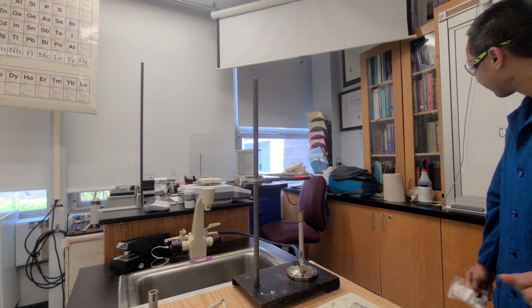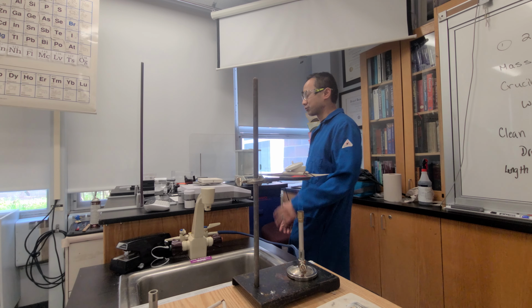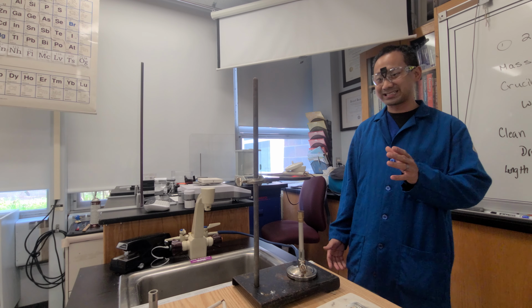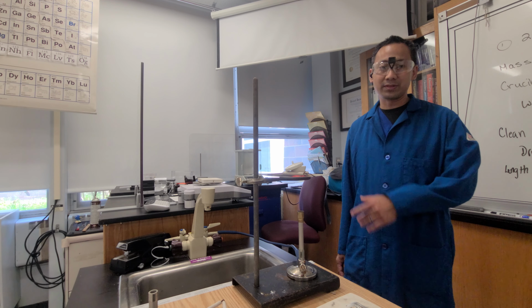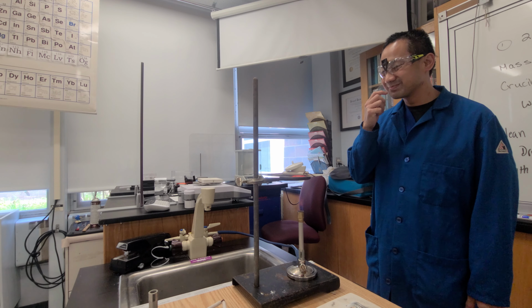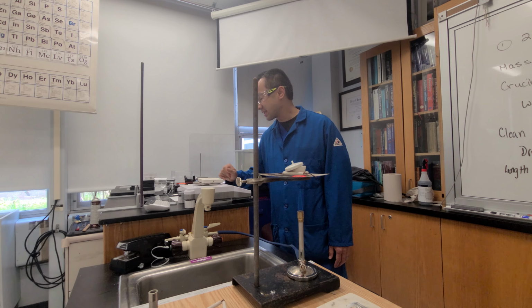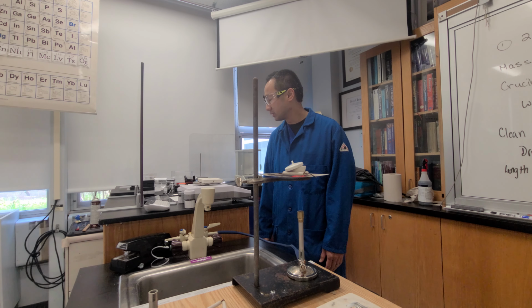We take the measure of the entire system together with the magnesium in it. Theoretically, you want to have this completely cool. I probably should have marked this particular crucible. It's already too hot, and I'm not going to let this cool. So we'll see if this survives. You know what? No, I'm going to leave it. I have an analytical amount of the magnesium in there. We'll go from there.